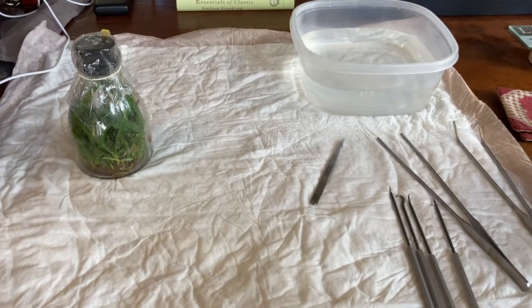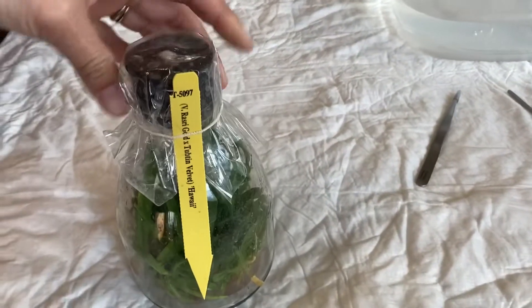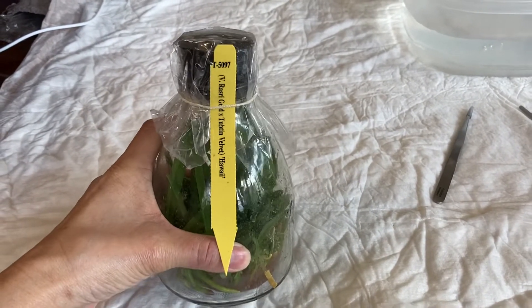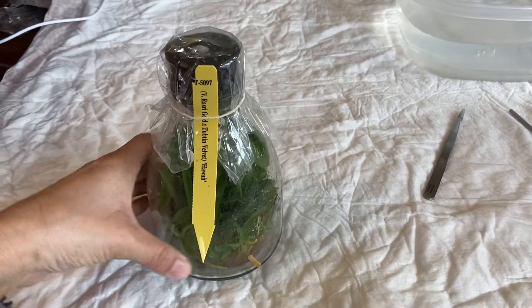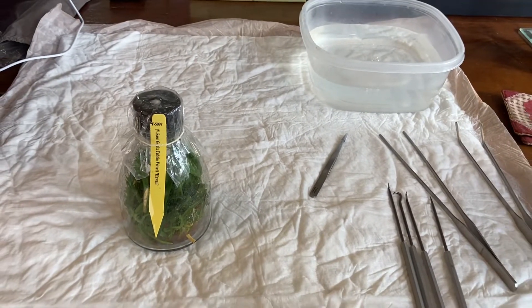I am ready to try my first flask. I picked this one because Pinto decided to bite at the tag on this and he managed to pop the cork out, so it's not sterile inside anymore. I only have a limited amount of time before it becomes infected because it's basically no longer sterile.